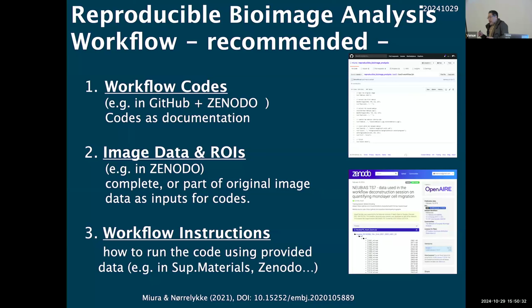So I'm saying that you should submit code instead of text, because computer code, you often think that this is for automation of workflows, but there's another very important aspect of code, which is another way of describing your methods. If this is chemistry, you use chemical formulas. If it is physics, use mathematics to make a precise description of whatever is done. In case of biology, somehow the tool is there, but people don't use it, which is code. You can record it.